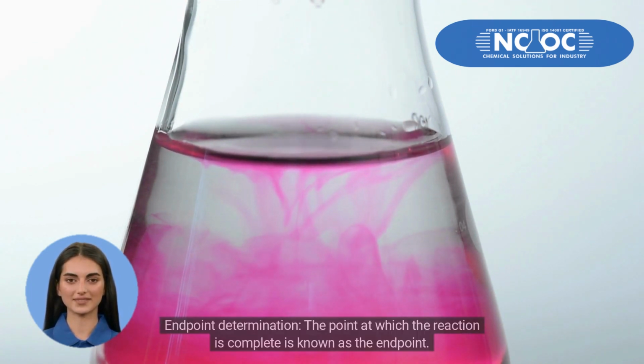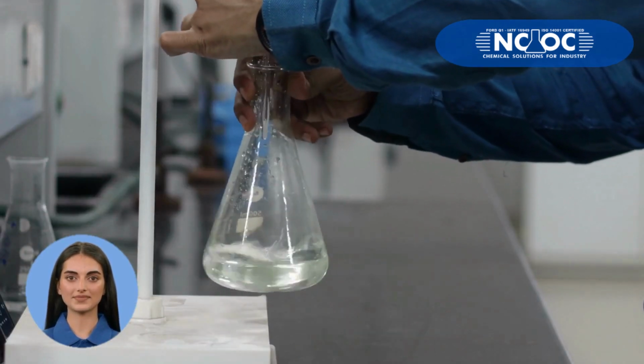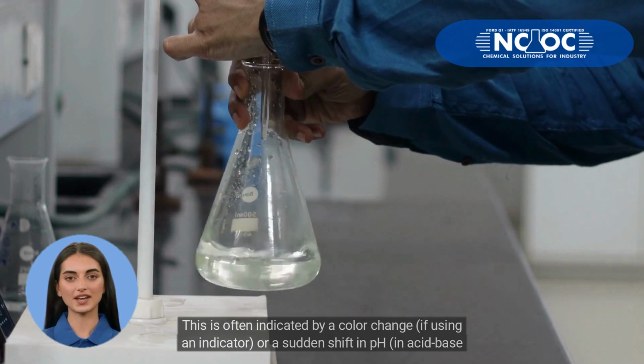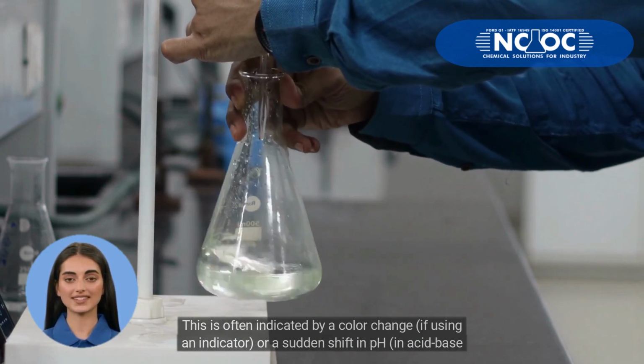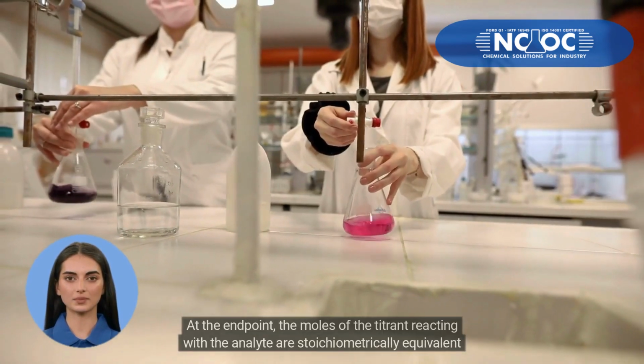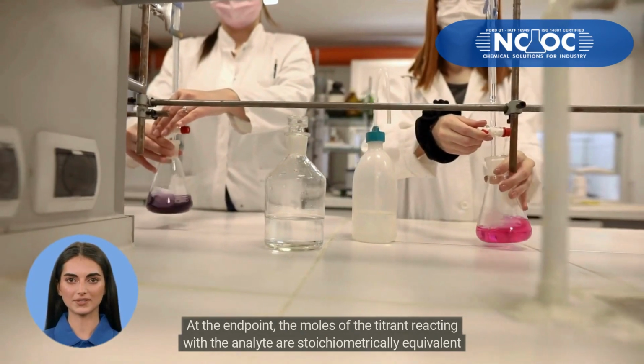Endpoint determination: the point at which the reaction is complete is known as the endpoint. This is often indicated by a color change, if using an indicator, or a sudden shift in pH, in acid-base titrations. At the endpoint, the moles of the titrant reacting with the analyte are stoichiometrically equivalent to the moles of the substance being analyzed.